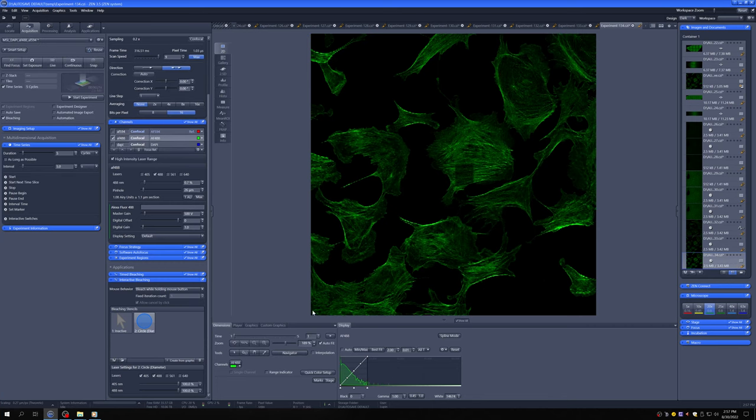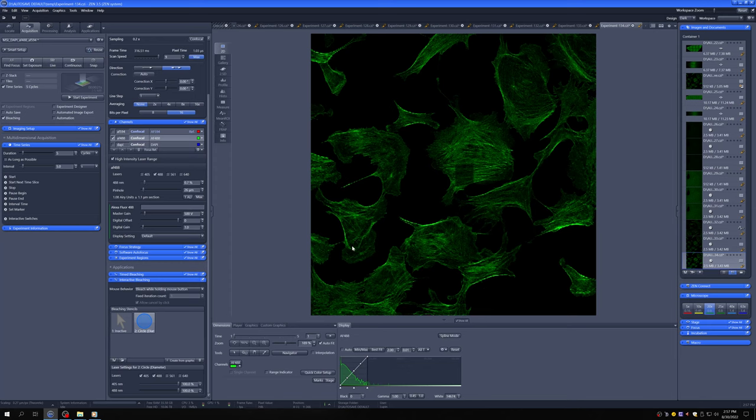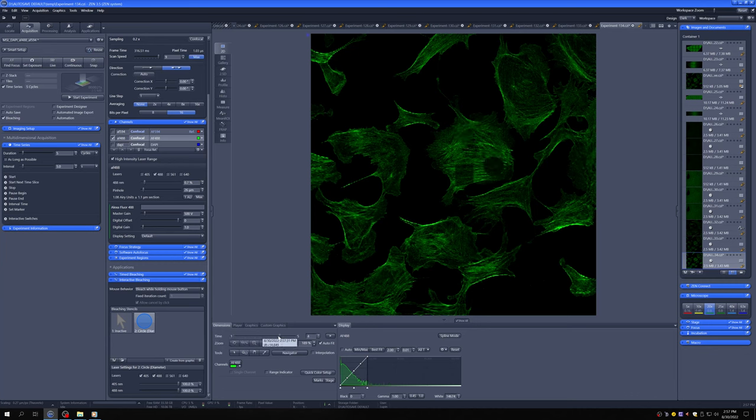So again, this is a useful tool if you're in a situation where cells are alive, moving very quickly, and you just can't set things up in advance to bleach or photo convert the things that you're interested in. So you can see here how that's my first bleaching attempt and then that's my second one.